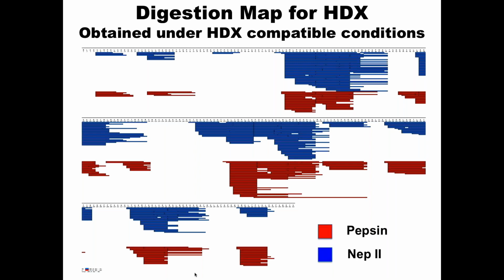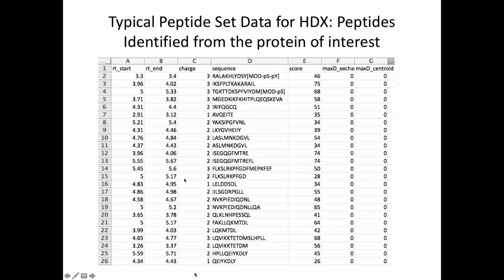Those that are very early may be just suppressed by all the urea and everything that's in the quench buffer. And then you may have some really hydrophobic peptides that just never come off. So there's those, but then there's these highly charged peptides that just score poorly in the process. But this generates our peptide set.